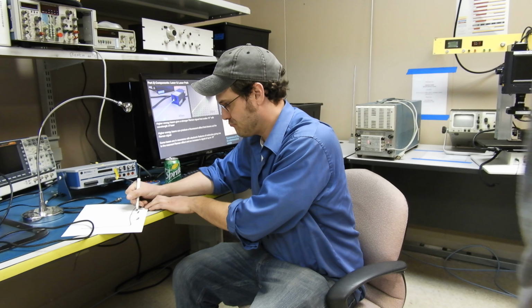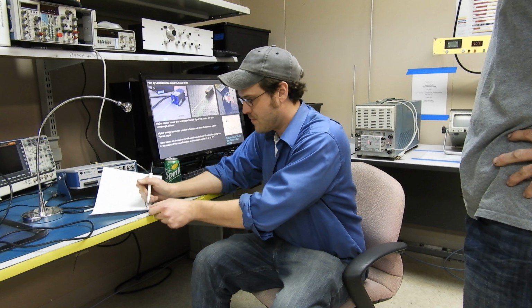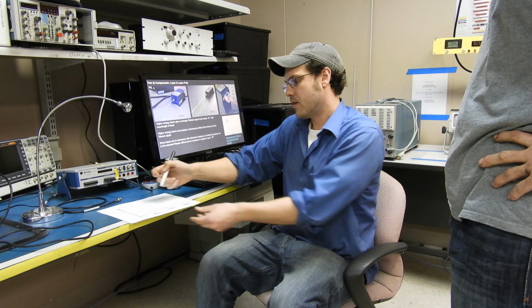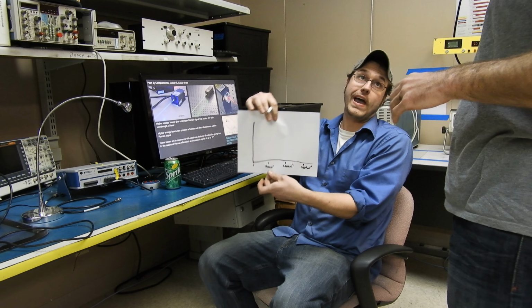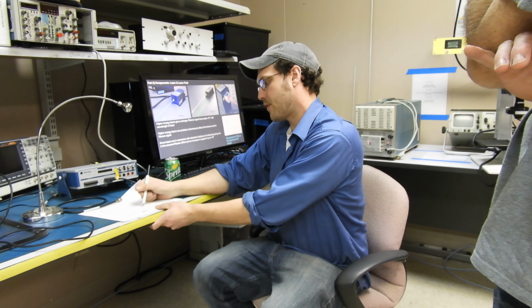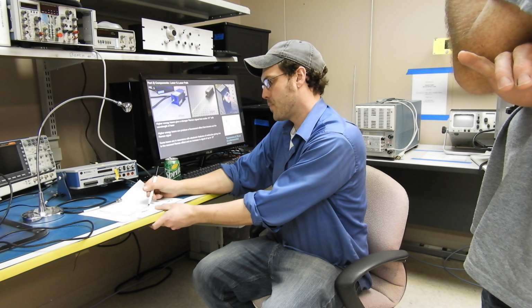Really what's happening is I'm just filling up a whole lot of space. I don't know what I'm going to do with it all. It might be valuable. So here, let's say we have the typical axes for a Raman spectrum. And so you might have peaks that look something like this: there's a noise background, then you get a peak.